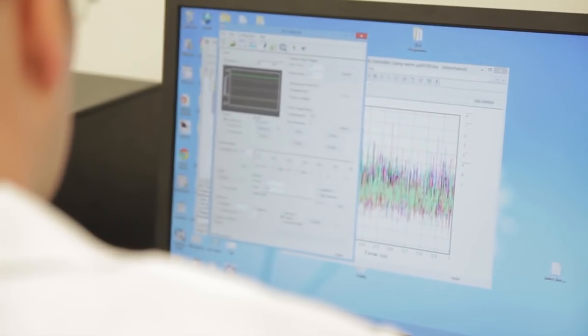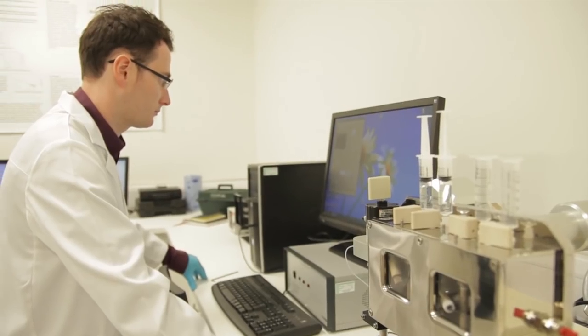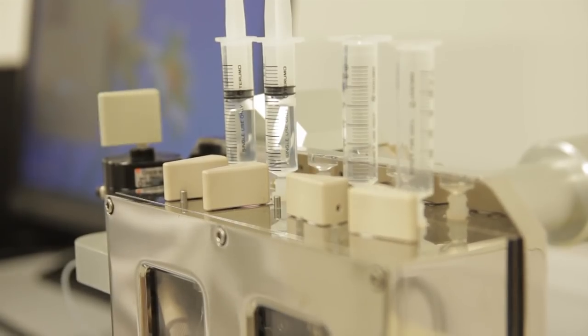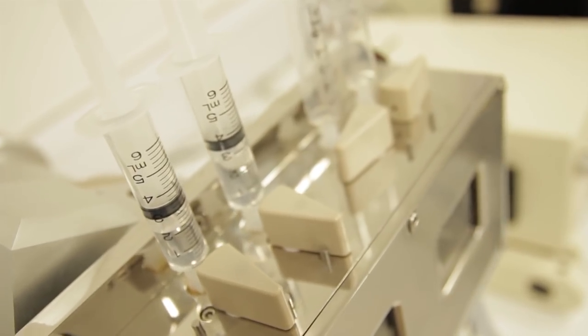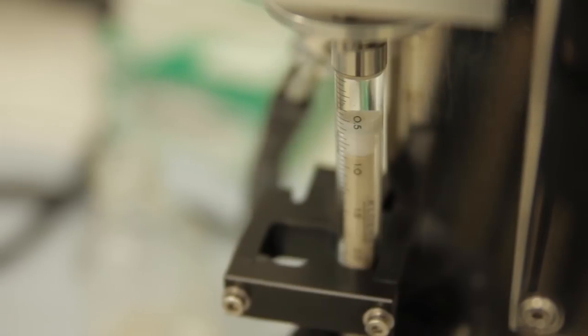The progress of a reaction or molecular event that occurs as a result of mixing can then be monitored through spectroscopic methods. We can begin measuring reactions that are approximately one millisecond old. Typically we want to measure changes in absorbance or fluorescence.